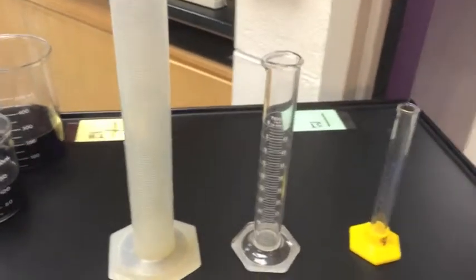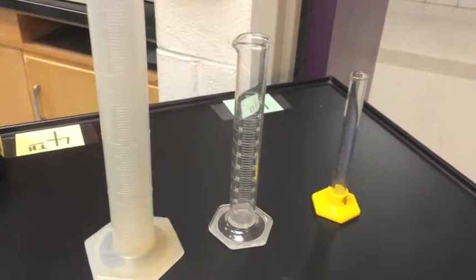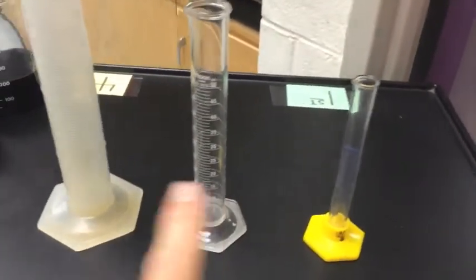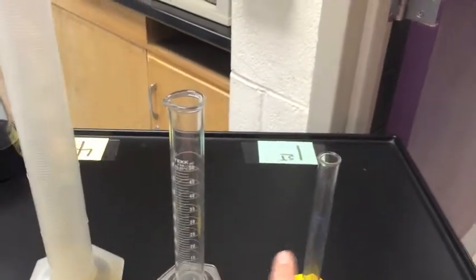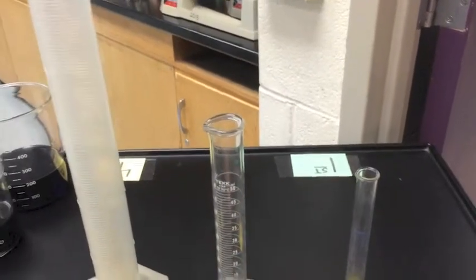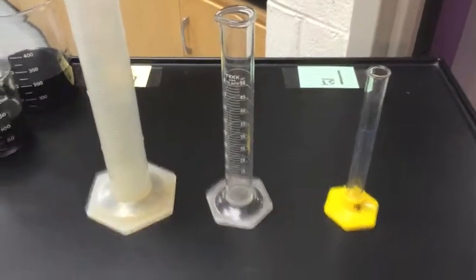Graduated cylinders are much more accurate than beakers and can measure, but we do have to watch out for the meniscus. Remembering that little smile, because especially in glass graduated cylinders, the water will cling or crawl up the sides, creating that smile, and you want to measure at the bottom. Hopefully that clears up the idea of measuring liquid volume using beakers and graduated cylinders.